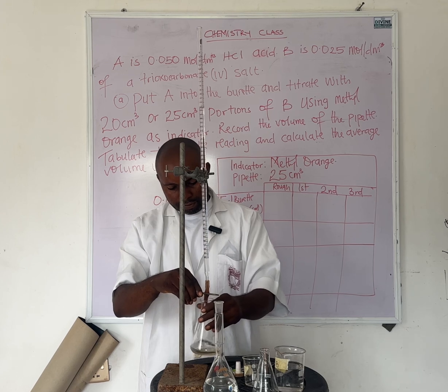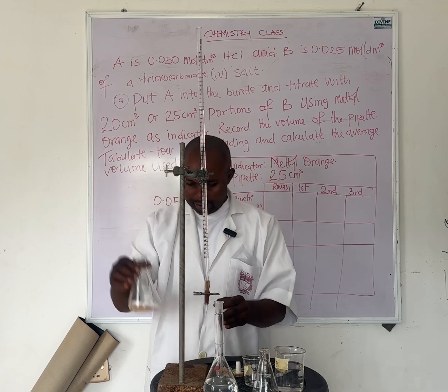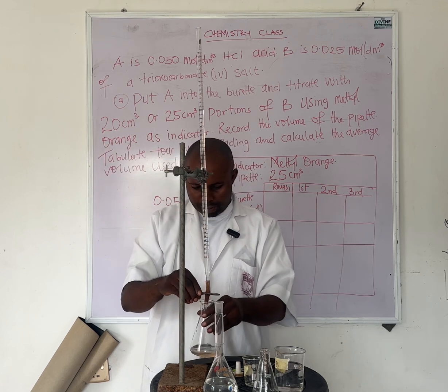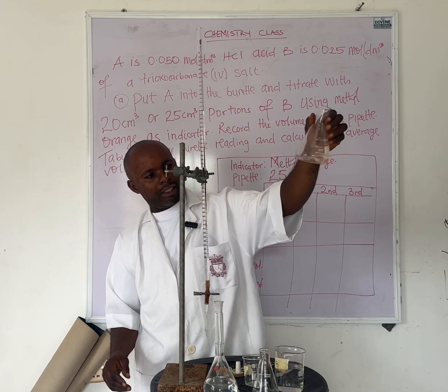Okay. The color is coming up. You have a light color. Look at this, there's a color change. So if peradventure I should add a drop, I should be able to have... So look at the color change. A light pink is achieved.